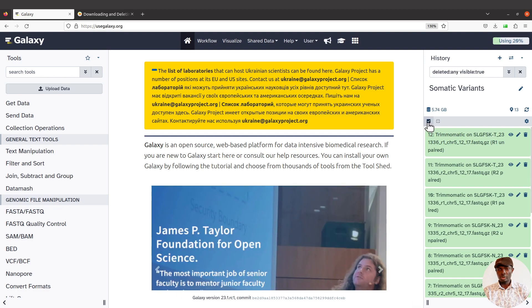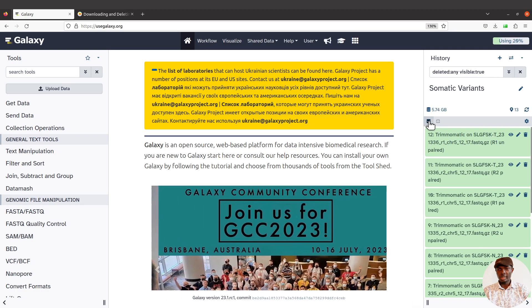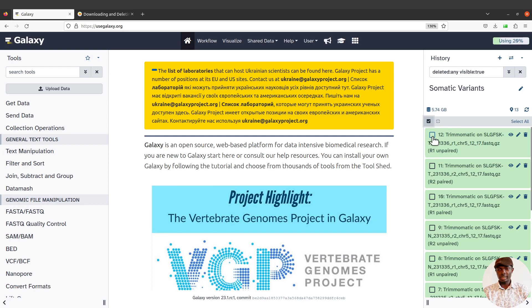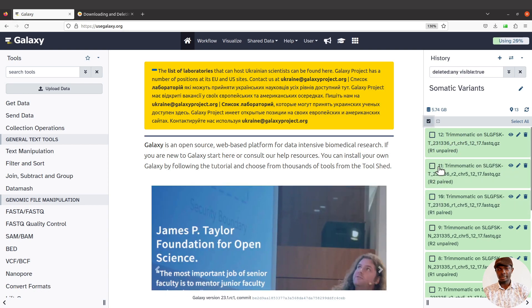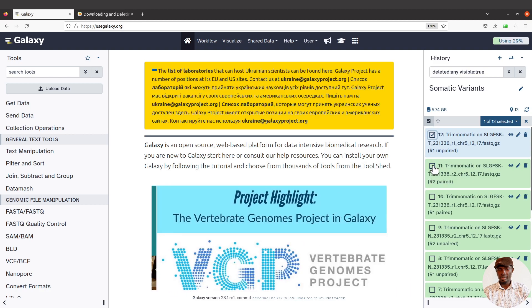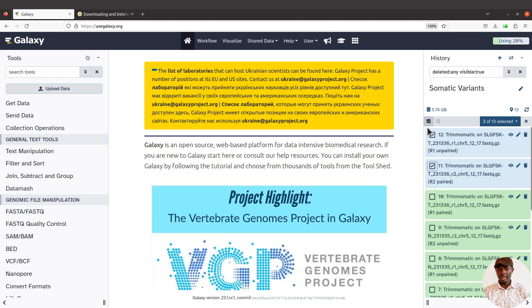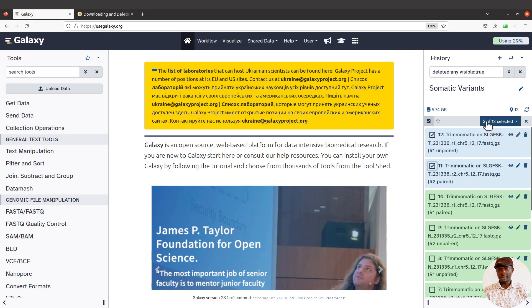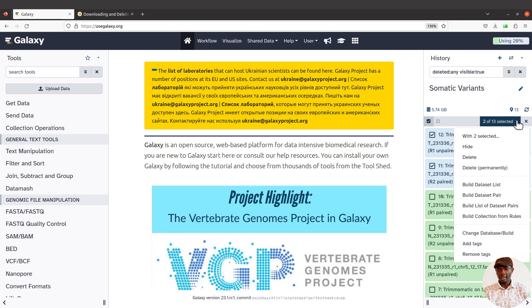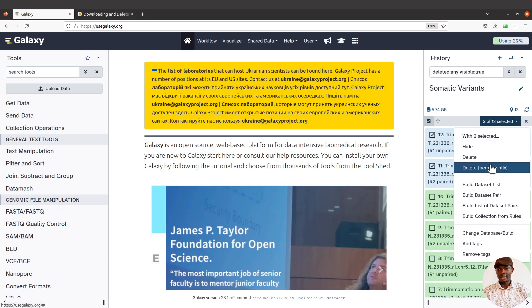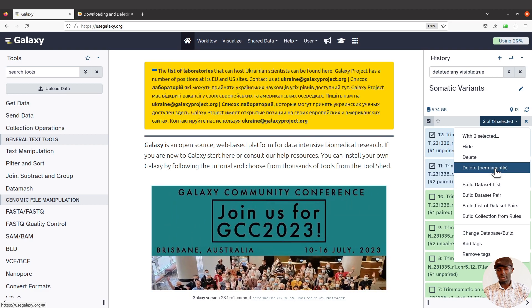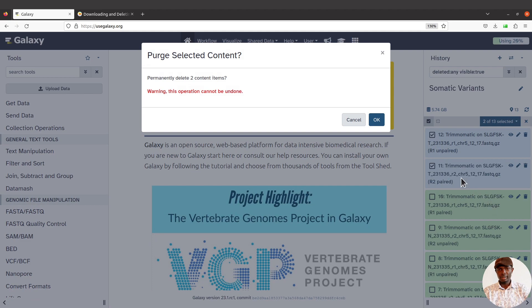In your history — the history that contains the files of interest — check this checkbox here. It says 'Select items', so click it first. When you click it, checkboxes appear, one for each dataset. Select the files you want to delete permanently. I'll select this one and this one — you'll see it says two of 13 selected. Then click on that box and scroll down to find 'Delete permanently', and click that option.